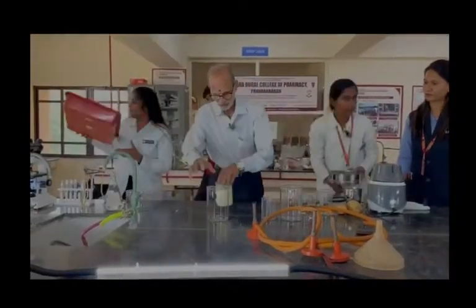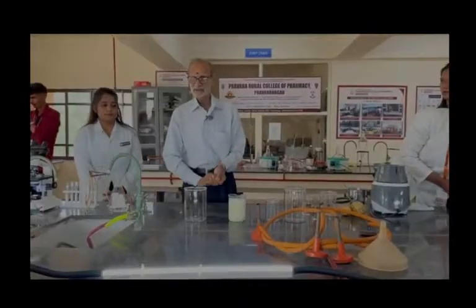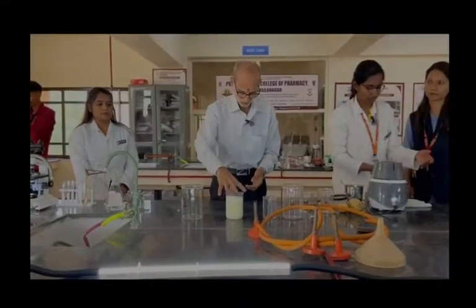Done. So now you can see here, the starch will settle down. The supernatant we will discard and replace it. We will give one more washing with the water.